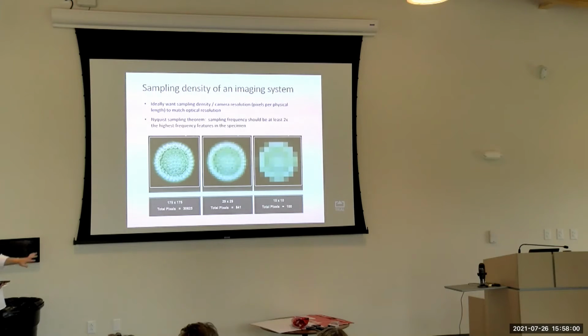Also, you may have heard of the Nyquist sampling theorem in other contexts, but you want to capture your specimen or your target at a frequency that's at least twice the frequency of the highest frequency features of interest in your specimen, so you're not aliasing patterns, things like that.